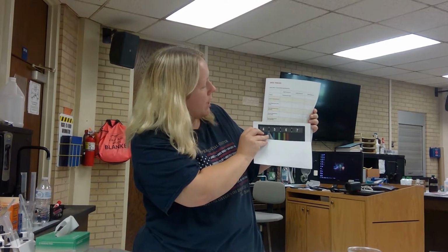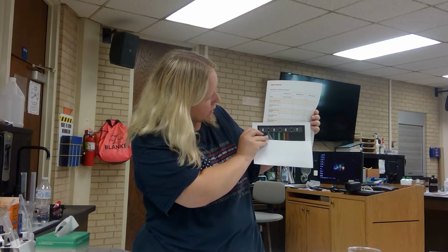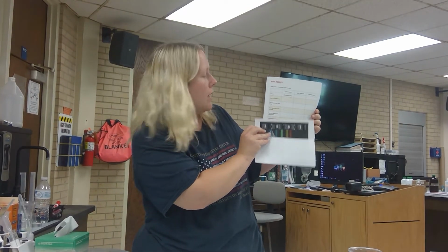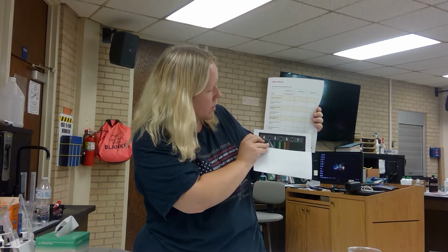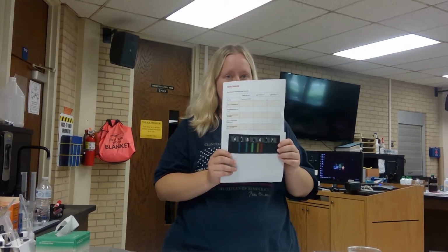And it appears at what line spectrum number? According to what I see here, 4.9 to 5. And then the same, I would put green down at what looks like 5.4. So use this spectrum to fill out this table.